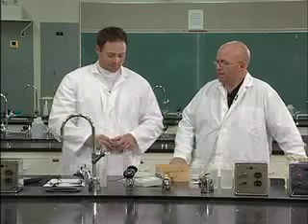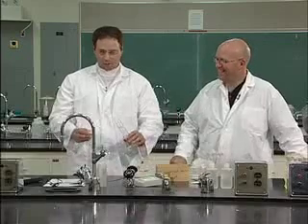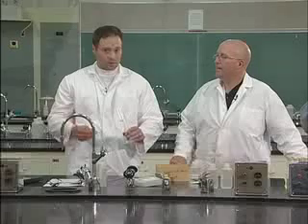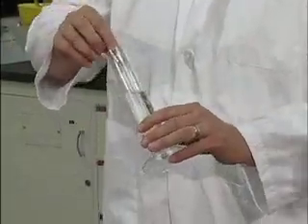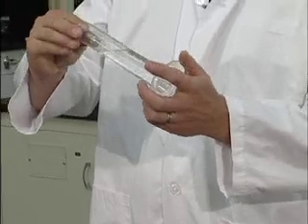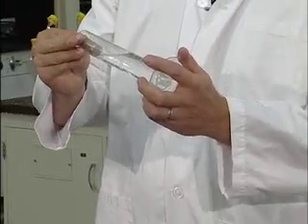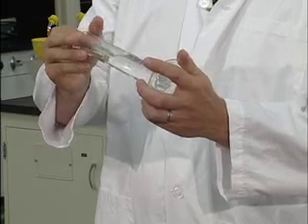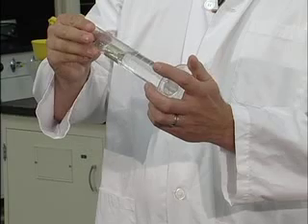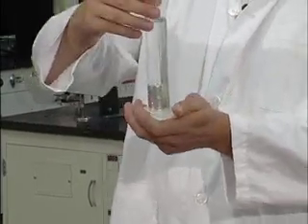Then I get to throw that in there? Yeah, you just get to drop it in. Well, not really. Okay? Now this is very important because you don't want to lose any of this water in this graduated cylinder, otherwise you have a mismeasurement. Mess up my volume. Exactly. You want to tilt this on its side, and slowly slide it in, because these objects often are quite heavy. So you want to slide it in slowly. And don't get your finger wet. No, definitely don't get your finger wet. And just slide in your object, just like so.